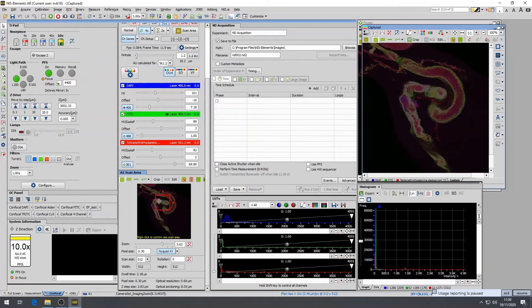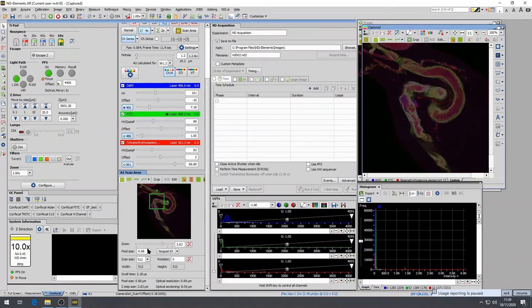The indicator box will become red and you will need to right-click on the box to accept the modification. When this happens, it becomes green and all the changed parameters can be seen below the scan area.